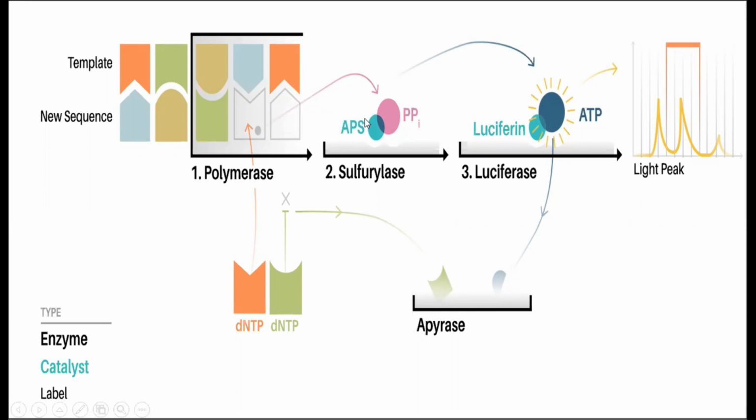What happens is that in a bead there are different sequences which are attached, and in your single stranded DNA sequence there was an adapter molecule. So the sequences that are attached on this bead are complementary to the sequences which are there on the adapter molecule. So once your adapter molecule finds your complementary sequence here, it will attach to it, and then your DNA sequence of interest, the single stranded, gets fixed.